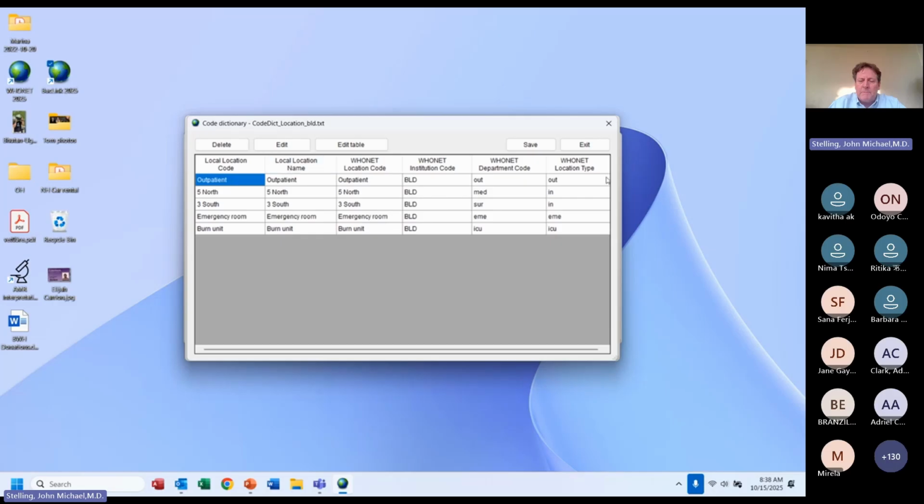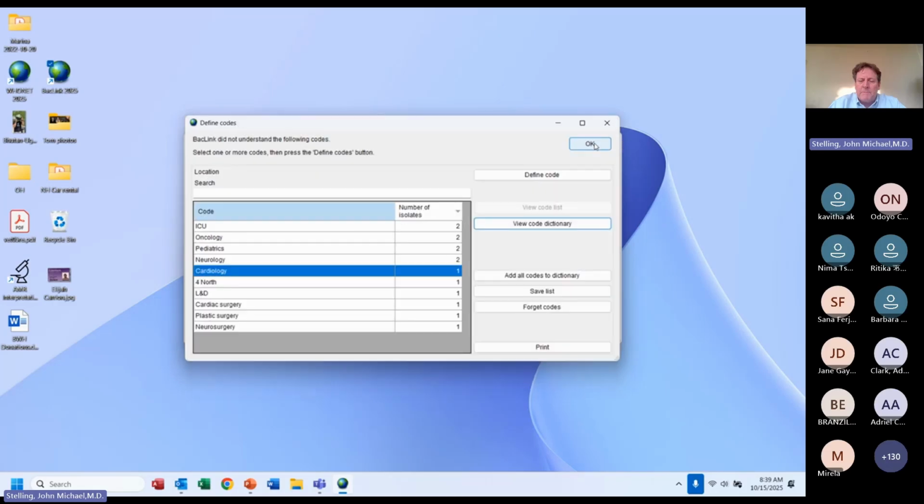Location type might be inpatient, outpatient, ICU, and emergency. Those are the 4 most common in the human sector. The animal sector, it would be like veterinary clinic, wild animal, zoo, farm animal, the environmental sector, food sector, market, restaurant, etc. So on the left is very specific. What was the true location? On the right, it's just a more general category suitable for analysis purposes. Not going to change anything. I did not finish all of them, but that's enough for now.